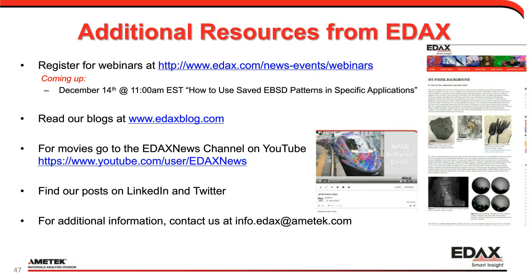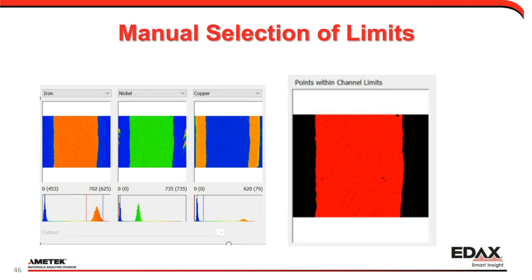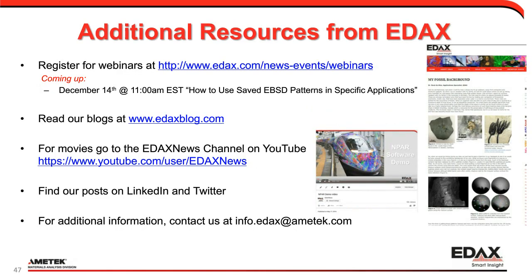And with that, we're really able to do different kinds of things. And just again, it's a tool for you, so that after the sale, you have the system, go ahead and really learn how to use that. And with that, I'll open up the floor to any additional questions.